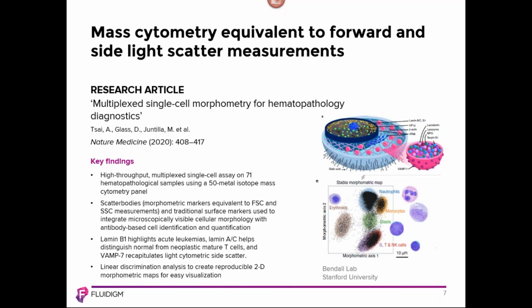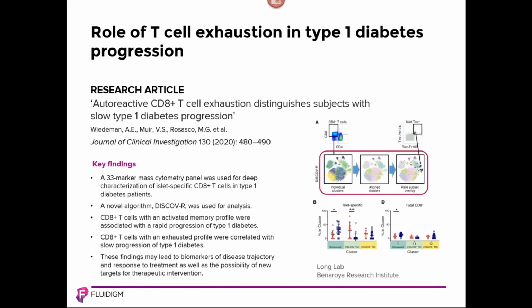Now mass cytometrists have access to and can quantify features that pathologists can recognize after multiple years of training. This method can potentially identify unique diagnostic markers as well as myeloid differentiation patterns for normal and neoplastic blasts and clonality that a pathologist cannot identify via traditional microscopic or flow cytometric methods.